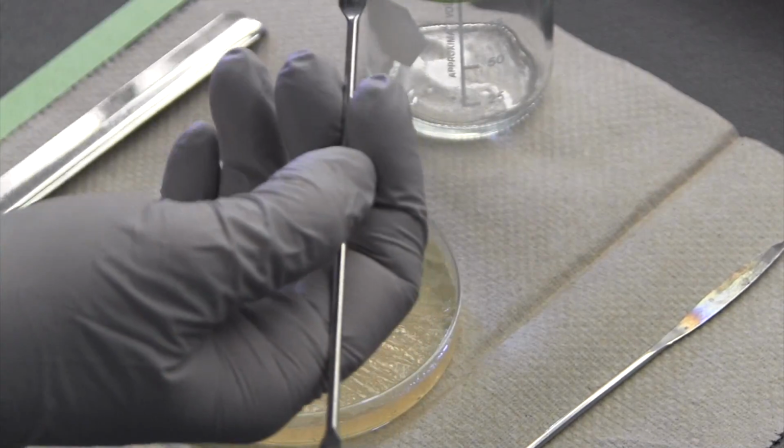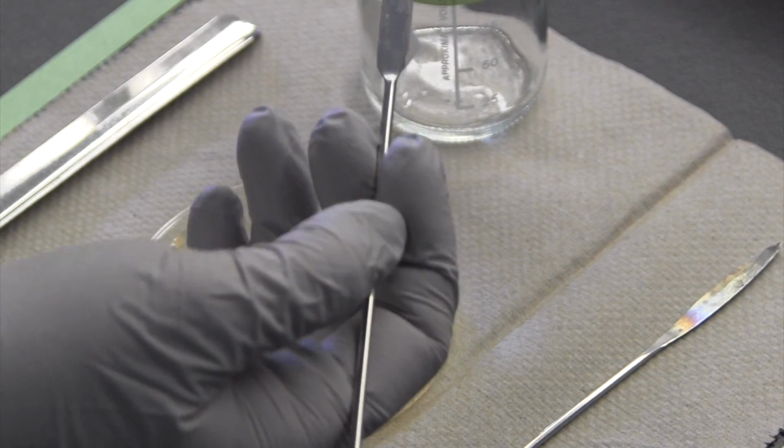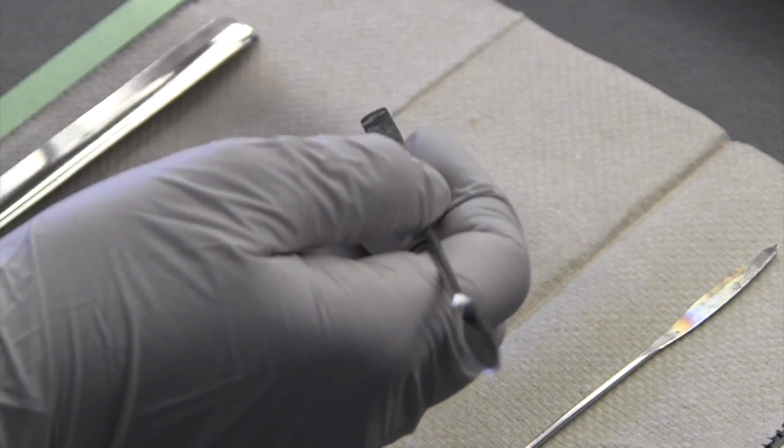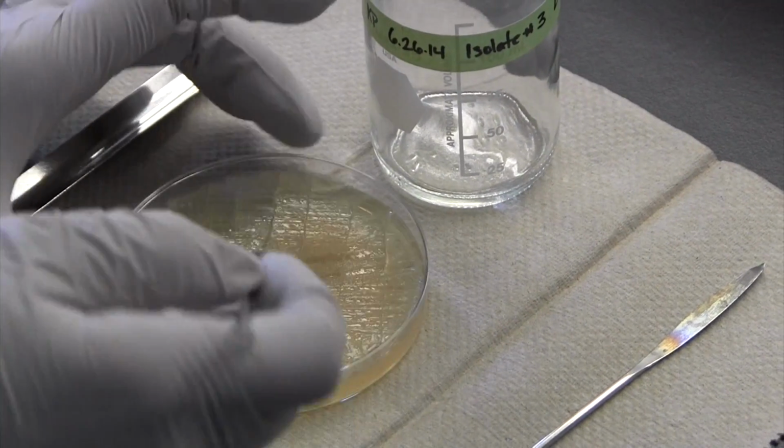So if you're short on these, you can actually just clean them with a bleach in between and share in your lab. That should be enough, because I don't think there'll be a carryover effect in terms of the chemicals that you're getting out. The vast biomass is all of this on the plate.